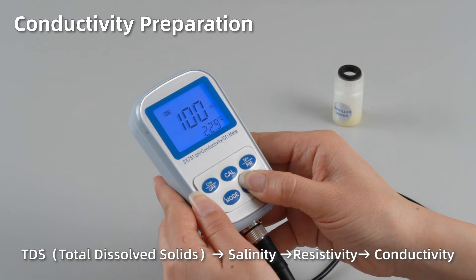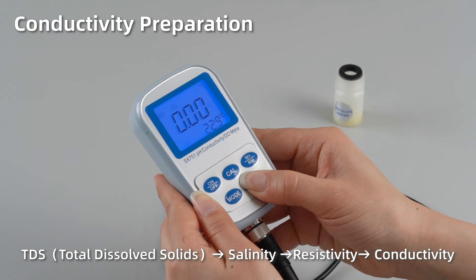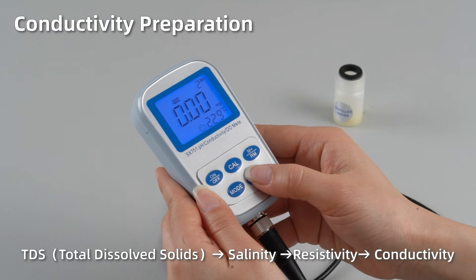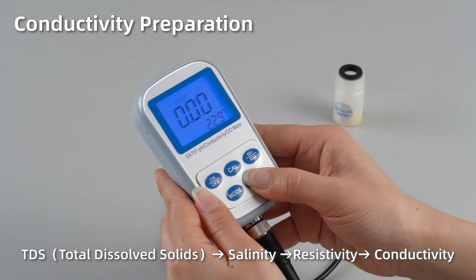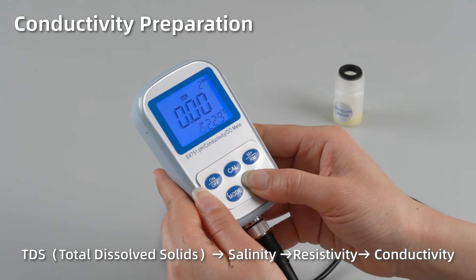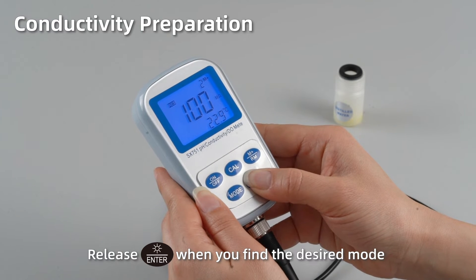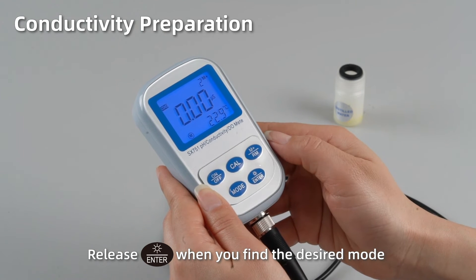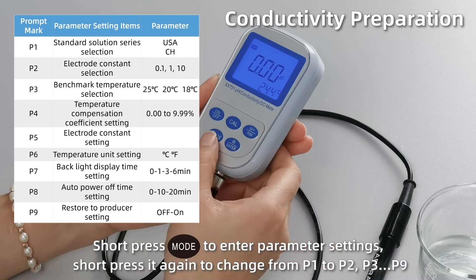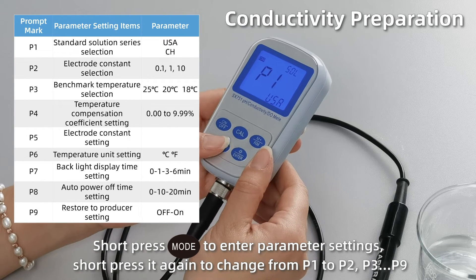From conductivity to TDS, salinity, and resistivity. Release enter when you find the desired mode. Short press mode to enter parameter settings from P1 to P2, P3, all the way to P9.